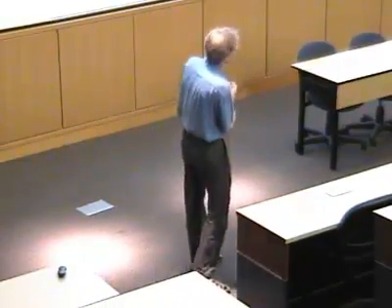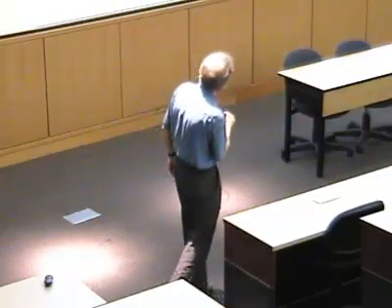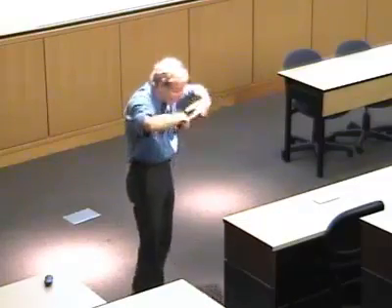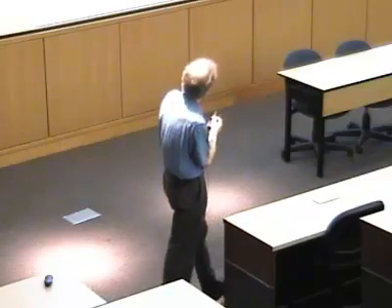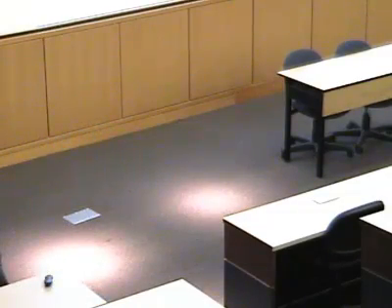Now, what is this device? It's concentric copper kettles, okay, with a little spigot at the bottom. And so what Lavoisier would do is he'd pack ice between the two kettles. He would do a reaction in the inner kettle, and as heat was given off, as most reactions are exothermic, it would melt the ice. He would collect the water from the tap at the bottom, and then he would weigh the water. So he made the connection between the mass of water that he collected and the actual heat that occurred in the reaction in the middle. Pretty ingenious for, 1780 or something like that. So calorimetry's been around a long time.